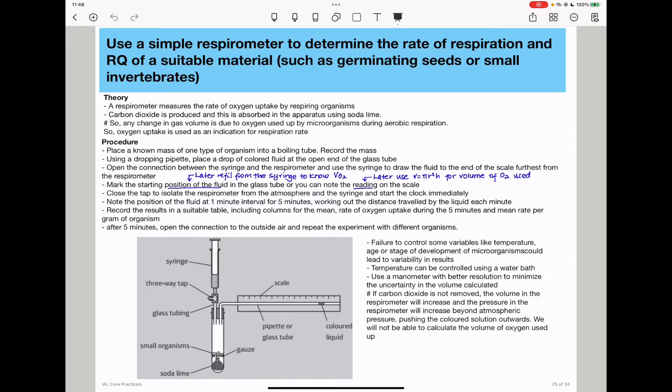Then you'll note the position of the fluid at one minute intervals for five minutes, working out the distance traveled by the liquid each time, and then record the results in a suitable table, including columns for mean, the rate of oxygen uptake during five minutes, and the mean rate per gram of organism.